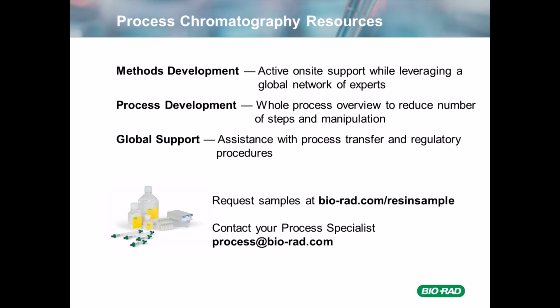The last question for now is, I'm interested in learning about design of experiments. Does Bio-Rad provide technical training on design of experiments for mixed mode resins? Oh, yes. We can set up a Zoom meeting or a webinar to go over the DOE design with you. For example, we can help you select the parameters and their ranges according to your purification needs, so as to understand the interaction between a target molecule and the resin.